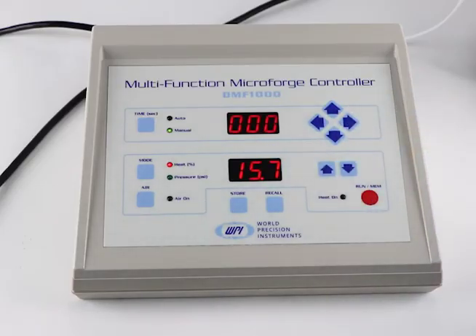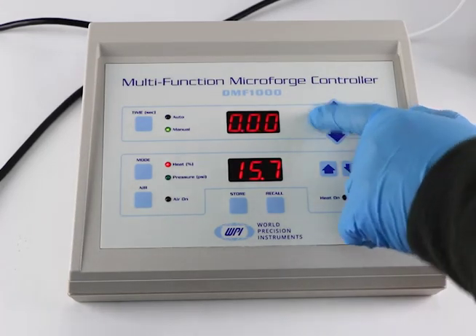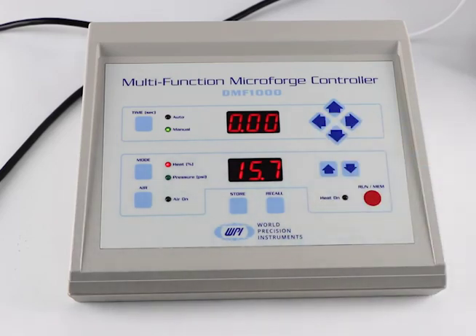You can set the time by pressing the right arrow to move the decimal point off the screen. With the decimal point in that position, the timer can be set to a maximum of 360 seconds. Press the left arrow another time to move the decimal point farther left, and the maximum time for the counter is 9.99 seconds before returning to 0 and starting over.